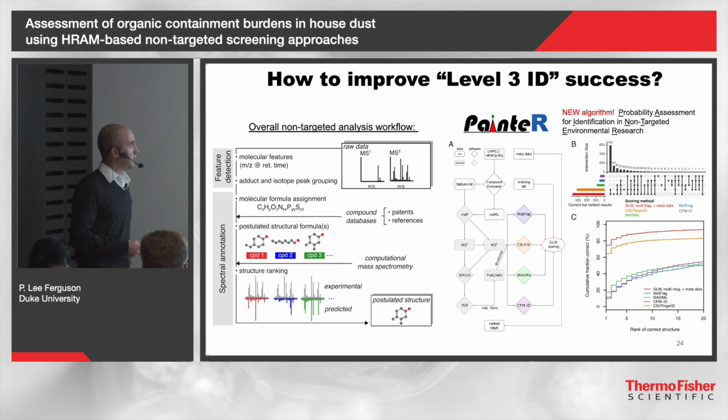What we're doing is we're taking our MS1, MS2. We use the Sirius 4.0 tool that I showed before to get formula assignment. In that case, we check that formula against what Compound Discoverer gives us to see whether they're the same. And then we start to postulate structural formulas. And so I mentioned yesterday, we're using PubChem that's annotated with sub-databases like DSSTox, HMDB, DrugBank, pesticides, etc. And then we pass our data here to rank these postulated structures using a variety of in silico MSMS tools.